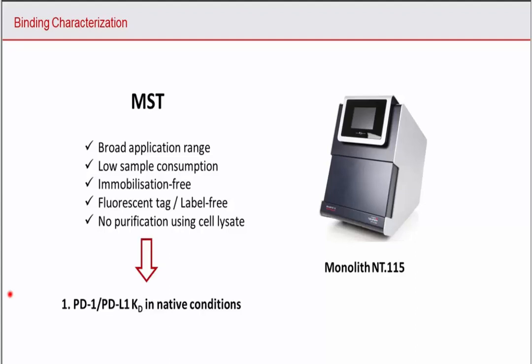So our first objective was to study the PD-1 PD-L1 pathway and get access to the KD in native conditions, to compare with data obtained so far in the literature. And then perform high throughput screening with the small inhibitors that I talked about previously.